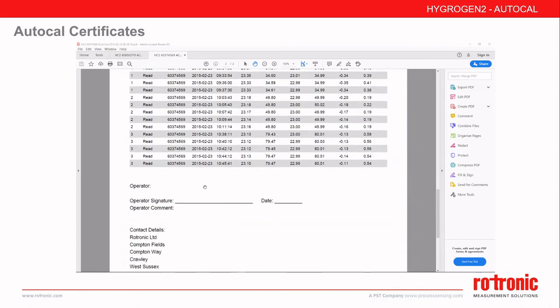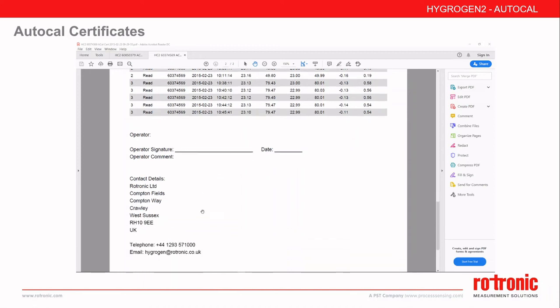The operator name will be listed here if entered, and there is space for the operator's signature and the date. Finally, the contact details as entered on the Hygogen are listed.